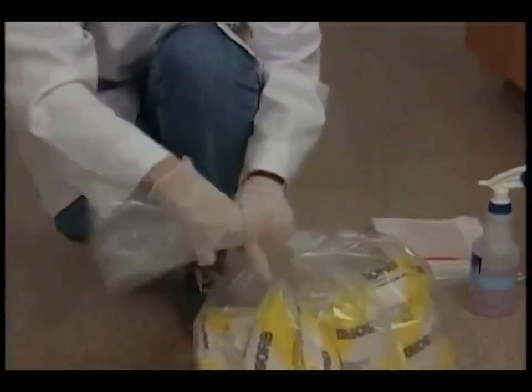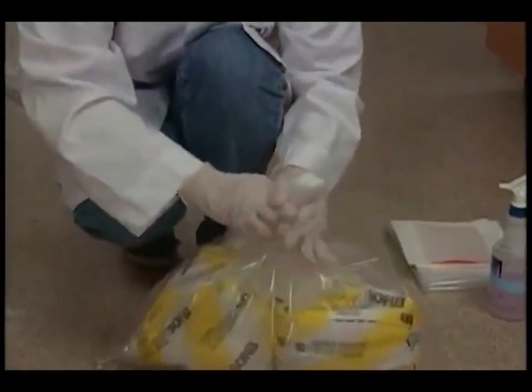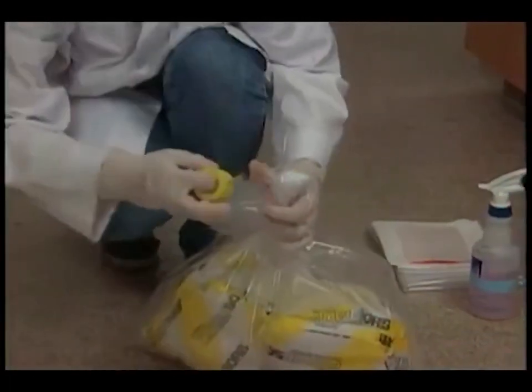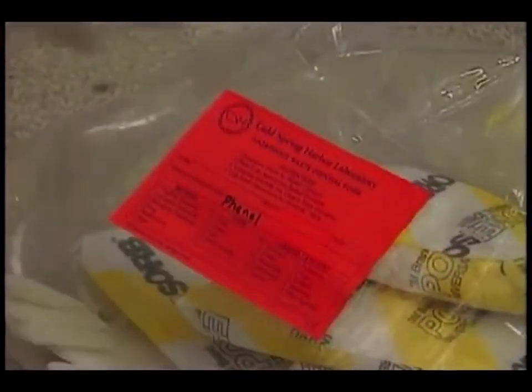Containment also means providing a good seal for the disposal bag. And don't forget to label it.